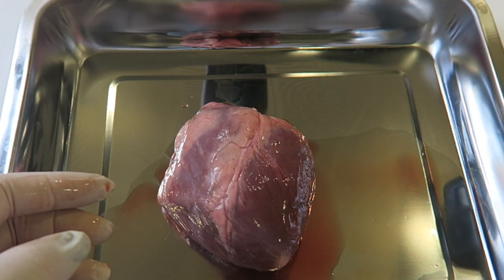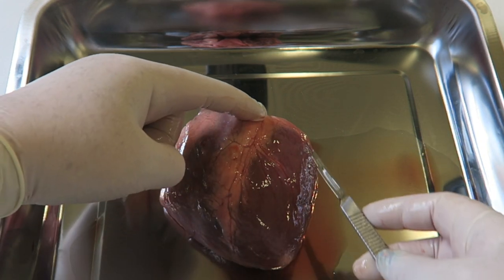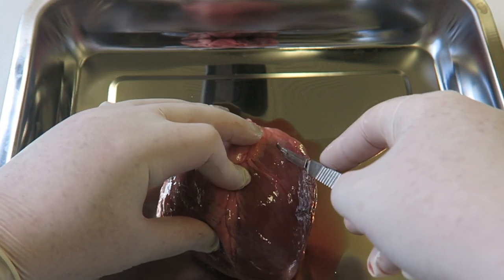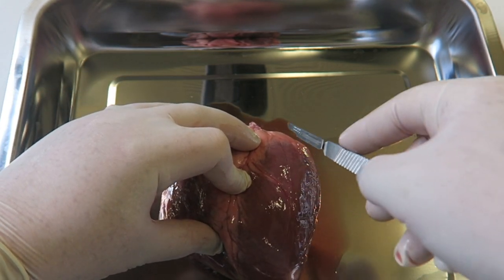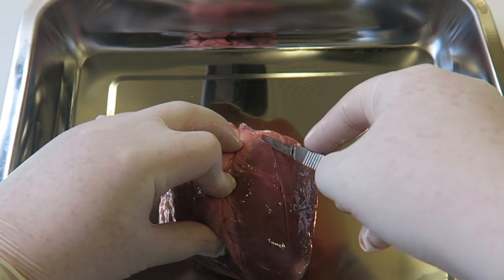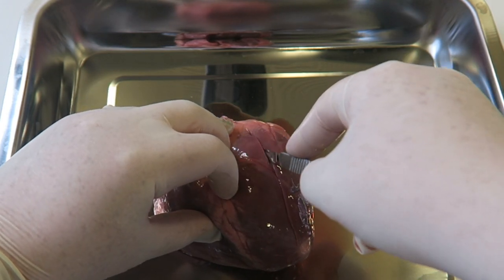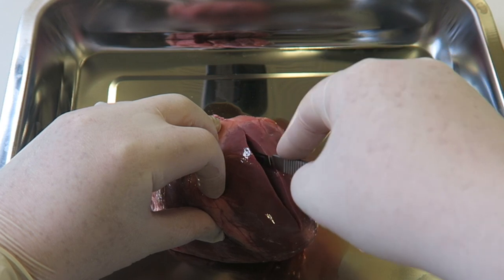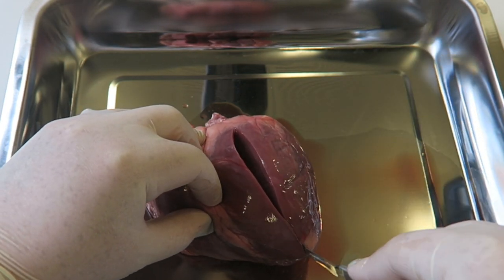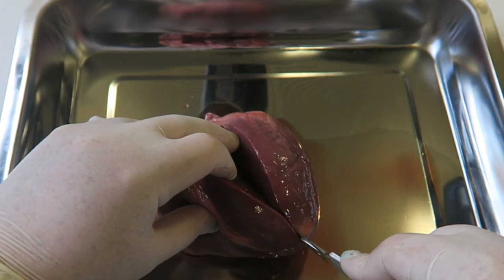So the first incision we're going to make is down here, kind of in line with the coronary artery. We use gentle strokes to go in. We are not in a rush with this. We don't have to hack this to death. What we want to do is to actually see what is going on inside. You can see here how thick this actually is.